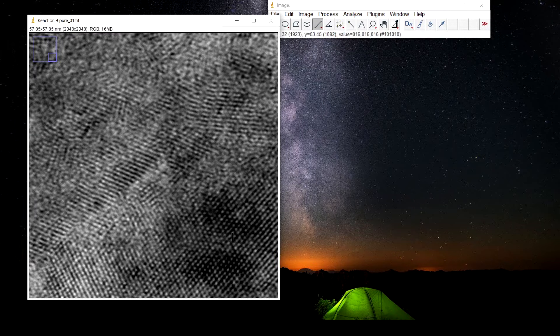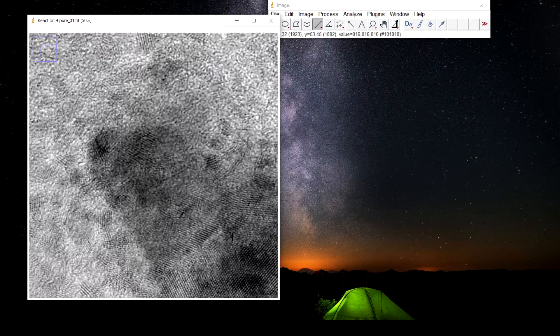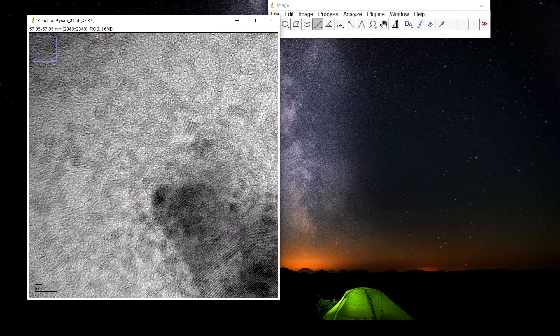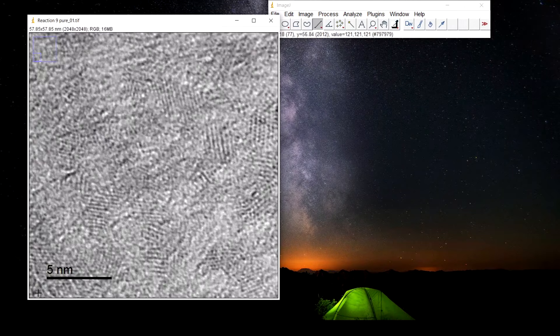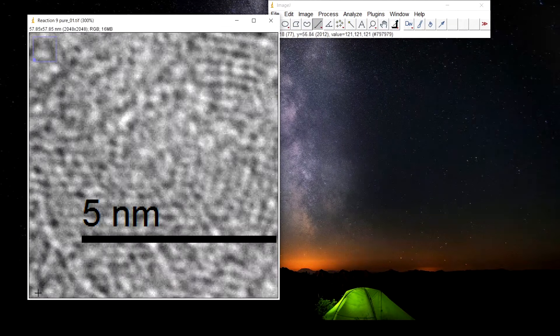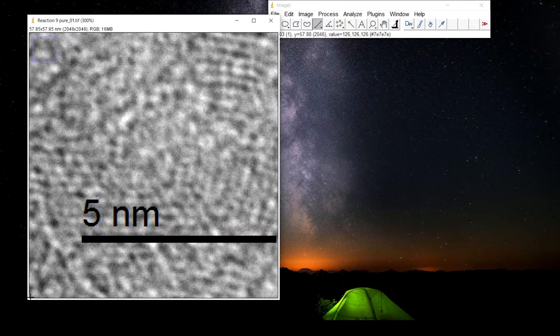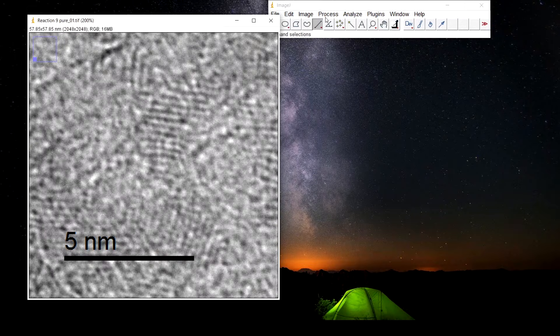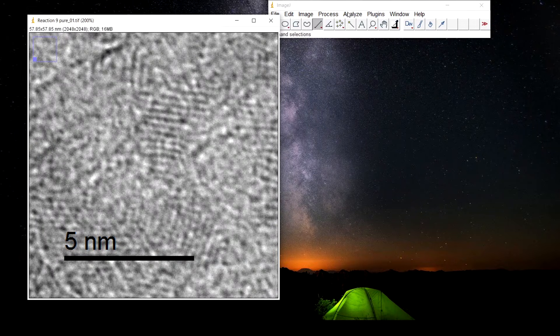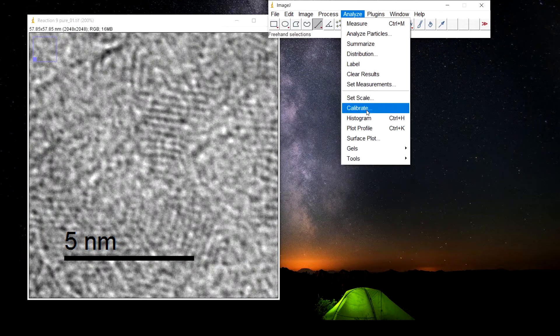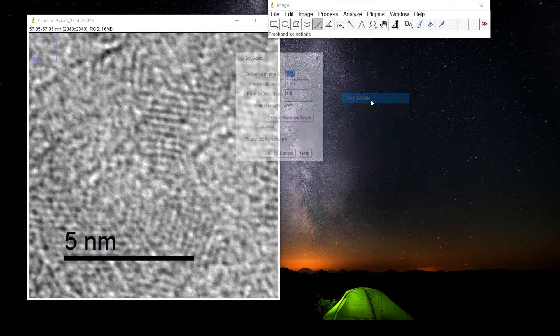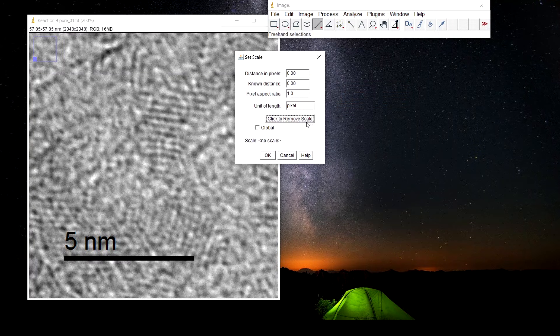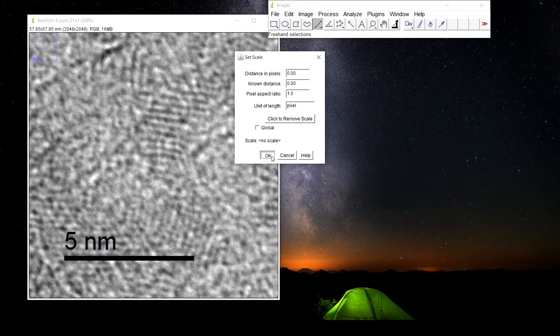For this, first we need to set the scale. We will zoom into the scale by pressing plus on the keyboard, then go to analyze, set scale, click to remove scale, press OK.